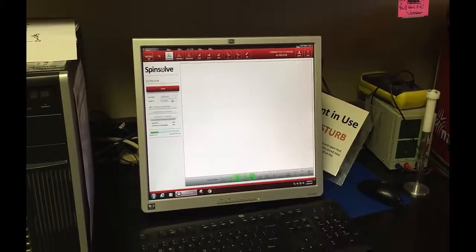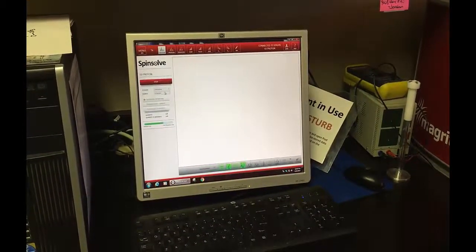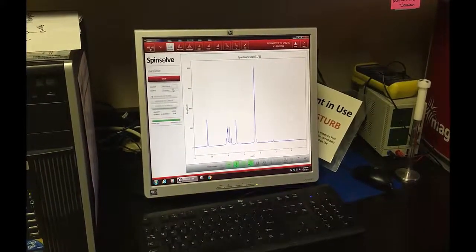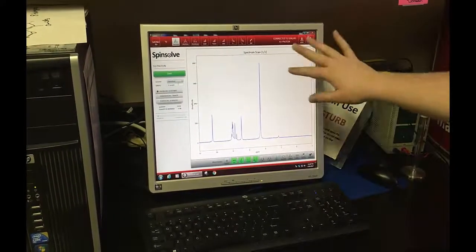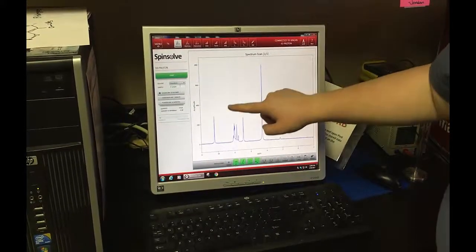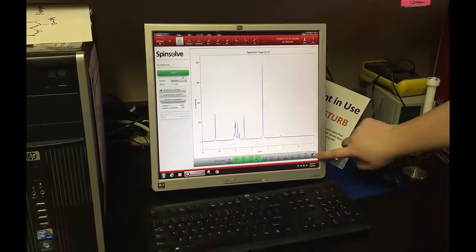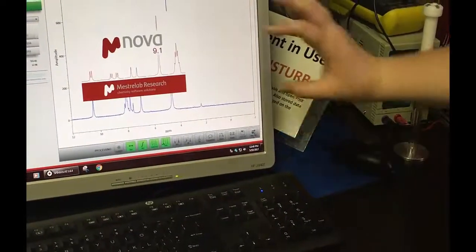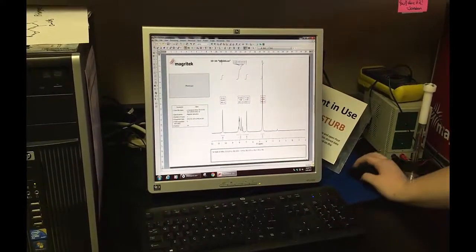It's going to run the sample through the machine, rotating the magnets around it. It's going to read each hydrogen on the functional groups, and it's going to spit out a data sheet right here. So this is your spectra from the NMR. That is an NMR of vanillin. Once you have that, you're going to go down here to the button that says MNova. Click on that, and that will transfer it to a different software that you can put peaks and different things on.